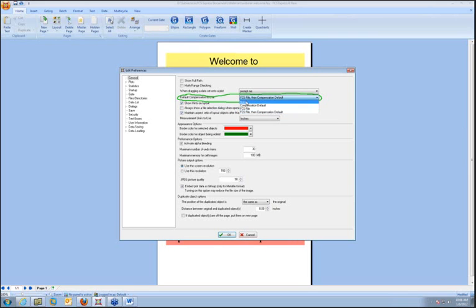You have a couple of extra choices here that people aren't aware of. If you pick none, then FCS Express will not load compensations automatically from the FCS file. So if you're going to actually make compensation on your own based on your own single stain controls and you don't want to use what's coming from the instrument, you'd want to change your settings here to none, so that you use what you've defined in the layout.